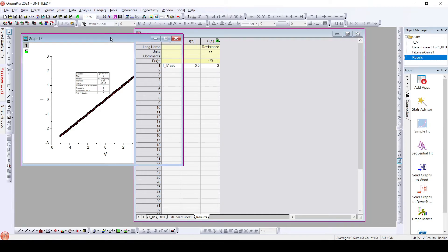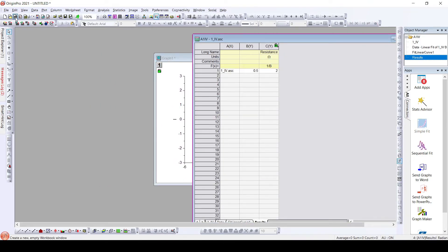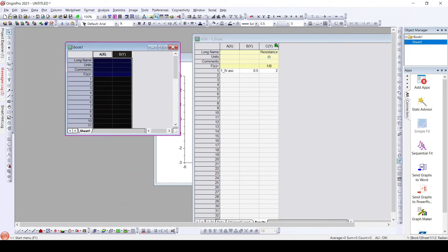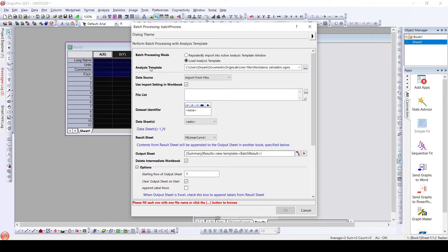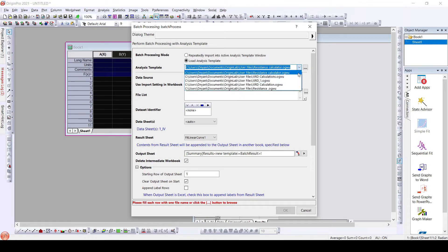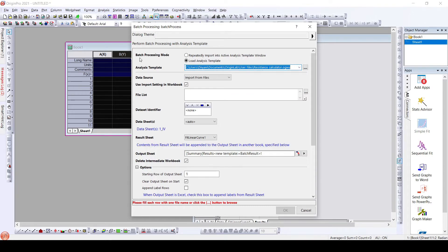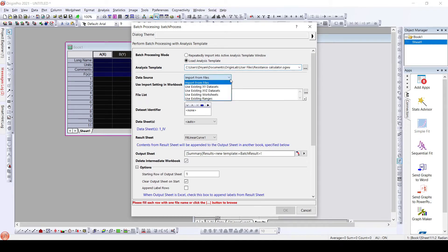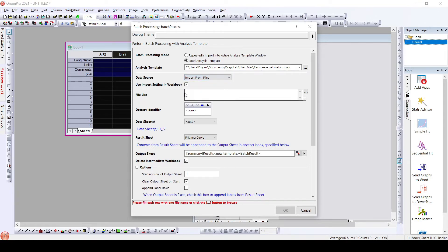Now in order to have batch processing of the data, I will get a new workbook and go to File > Batch Processing. In this batch processing window, we need to choose the analysis template. I have different analysis templates already created, and the one we just created is 'resistance calculator', so I will select that. The batch processing mode would be 'load analysis template'. The import data source can be 'import from files' or existing already-imported data.